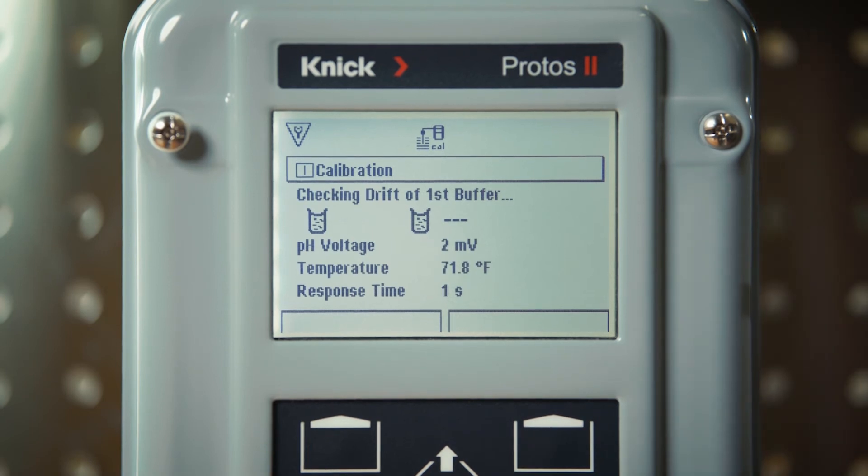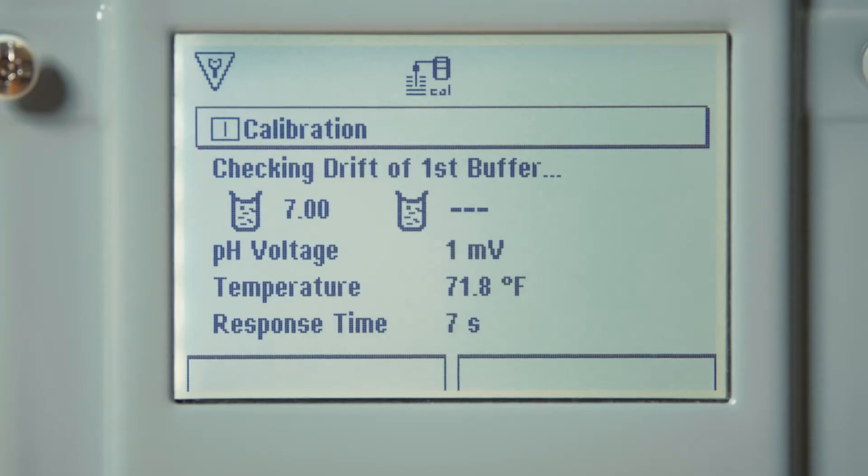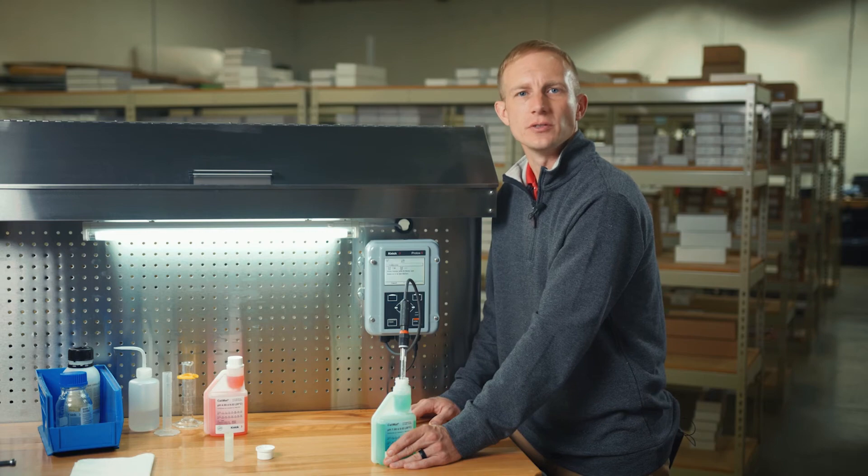After pressing next, the transmitter will begin to check the drift of the sensor in the first buffer solution. You can see that the buffer value is automatically recognized. The raw pH voltage value is displayed along with the measured temperature and response time of the electrode.